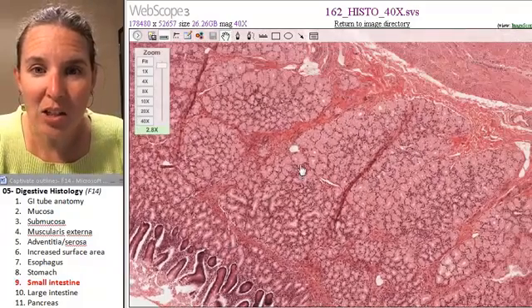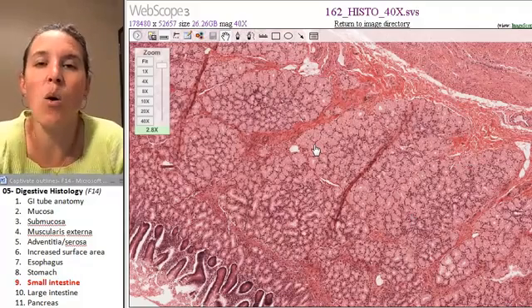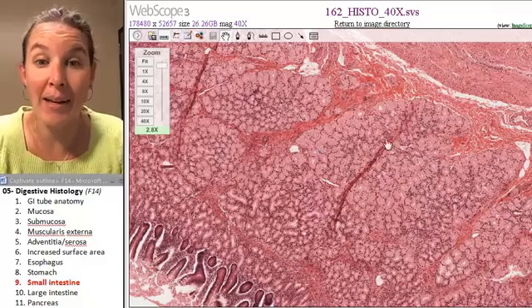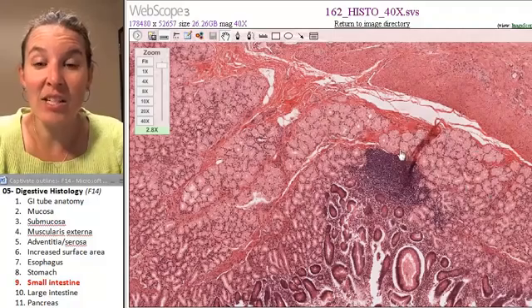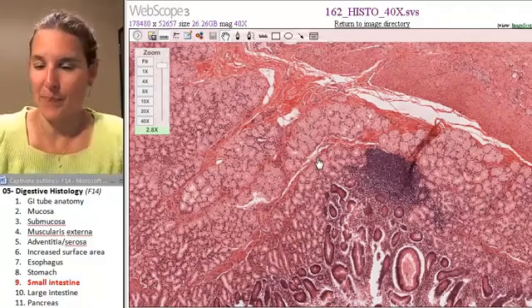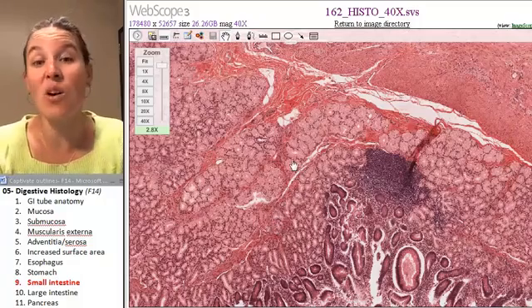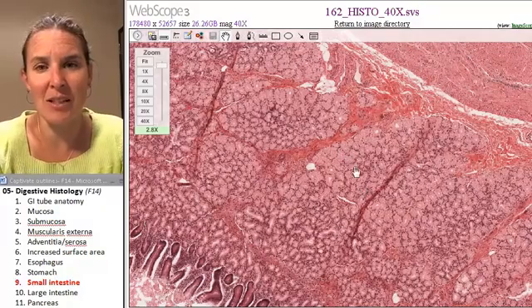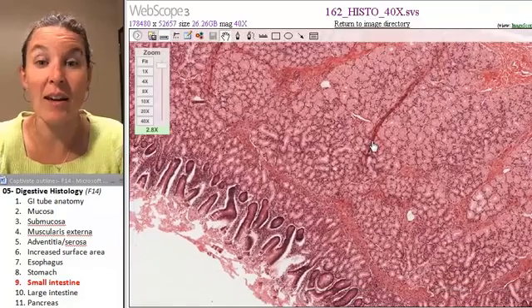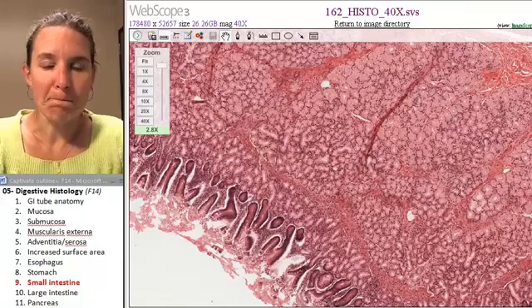Look at this glandular tissue. Holy gland madness. If you see that kind of glandular tissue deep to the muscularis mucosae, here was our line of muscularis mucosae, you know you're in the duodenum. Just look for those glands. That doesn't even look like stomach. That's even crazier than that. Holy glands, right? Perfectly clear.